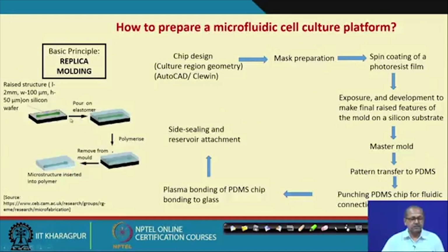Up to this point you are using photolithography techniques, then the remaining steps are done, and all the techniques should be done in a clean room, because it is at the micron level, all the setups are at the micro level.